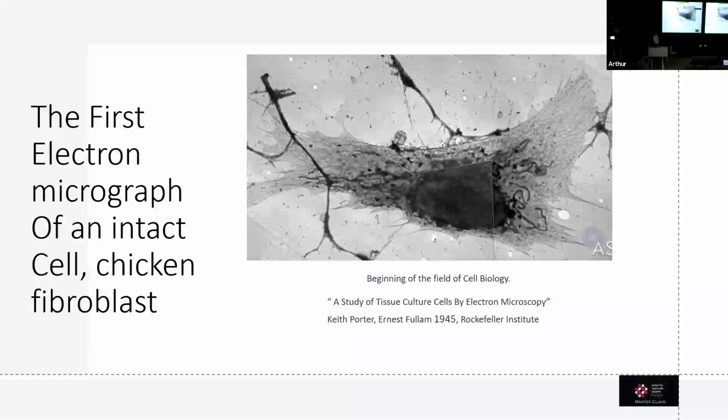This is done with film on a 120 kV electron microscope, and you would be hard-pressed to get a picture as good as this in today's modern electron microscopes. So the work that these people did back in the 50s is really incredible for the technical abilities that they had.